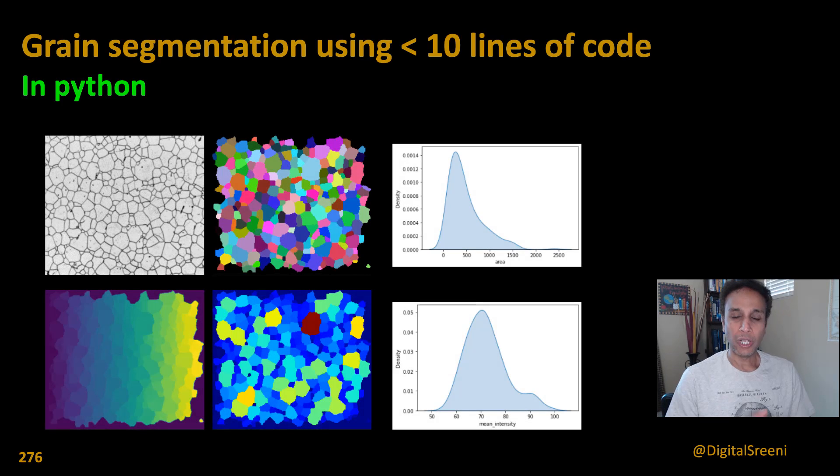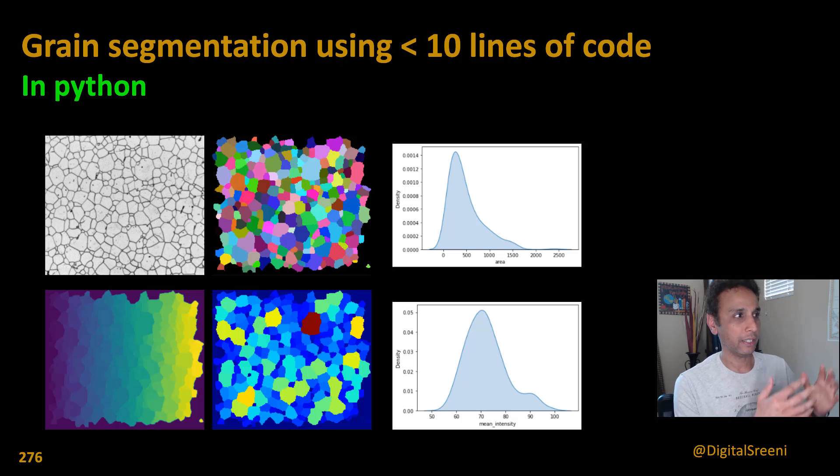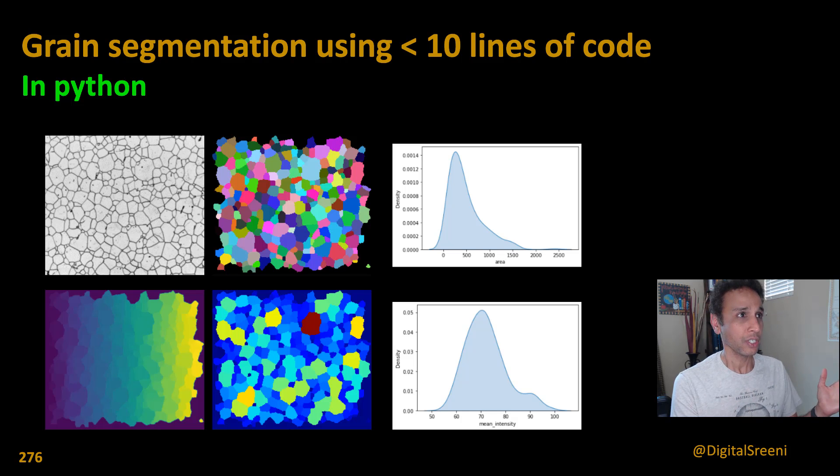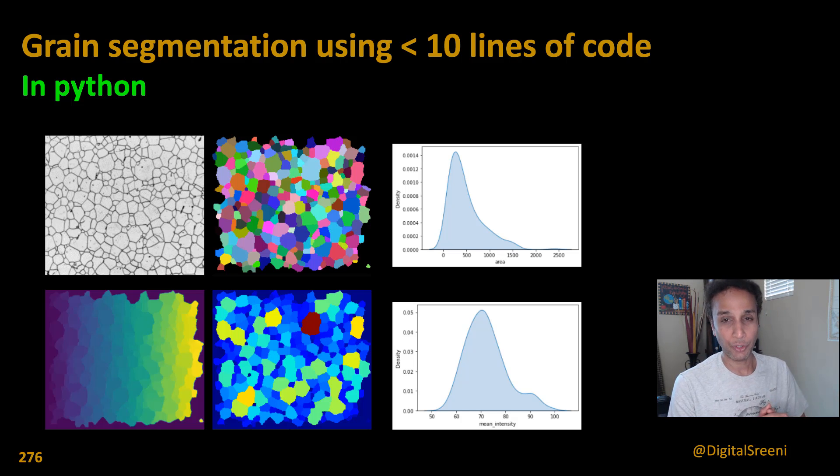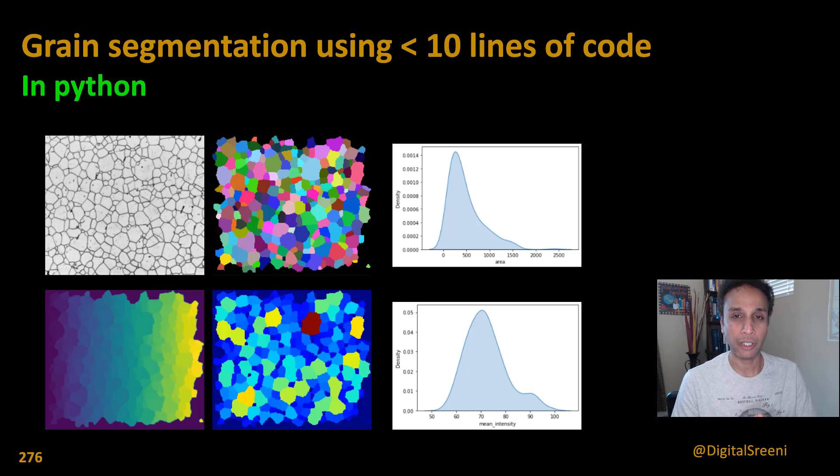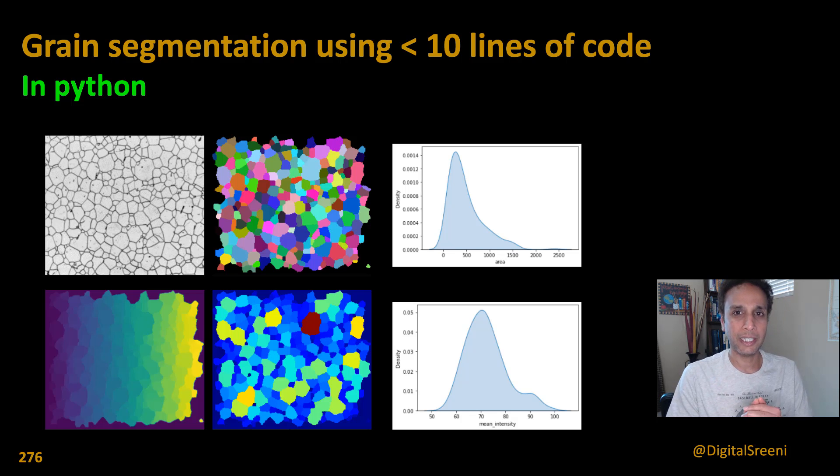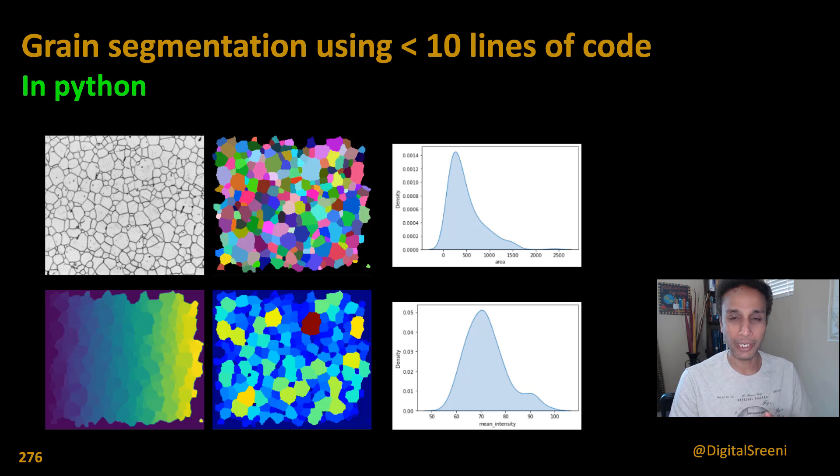Hi everyone, welcome back. In this video let's see how we can segment grains in an image using less than 10 lines of code. I'm going to use the same library I talked about in the last couple of videos, which is pyclesperanto. It's an amazing library that boils this down into a single line.